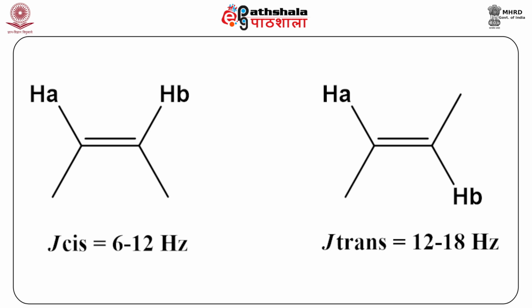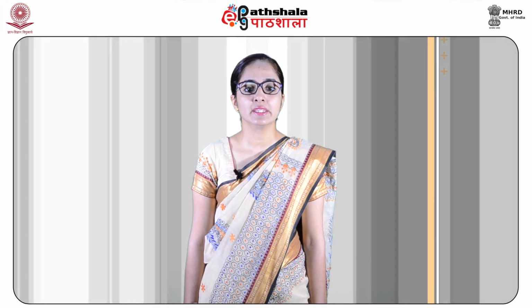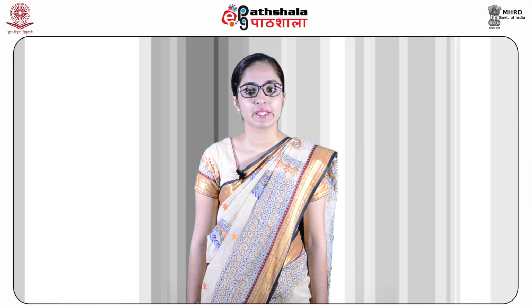Thus, it is possible to determine the configuration of geometrical isomers of a disubstituted olefin easily through proton NMR spectroscopy. Similarly, students, the axial and equatorial protons can be distinguished on the basis of different values of their coupling constants and chemical shifts. The equatorial protons in a conformationally rigid cyclohexane ring appear more downfield than the axial protons on the same carbon.